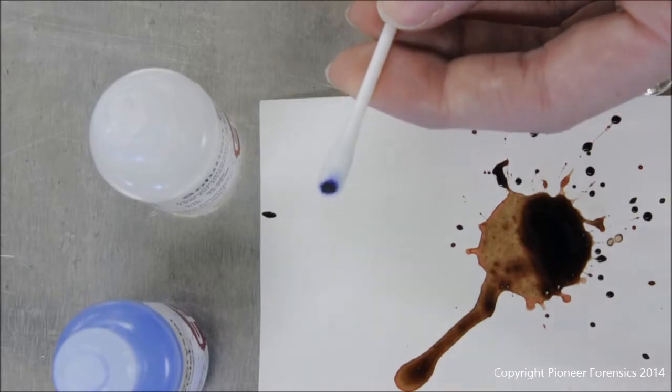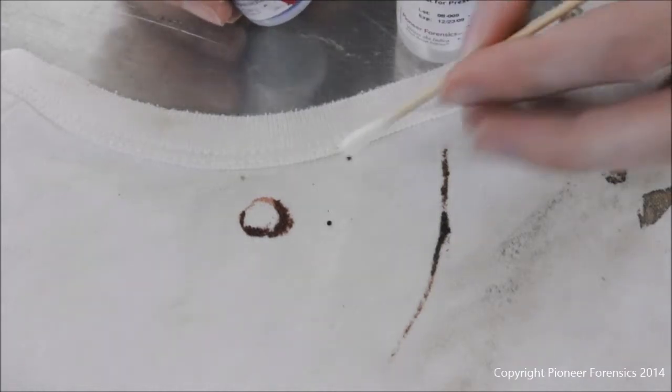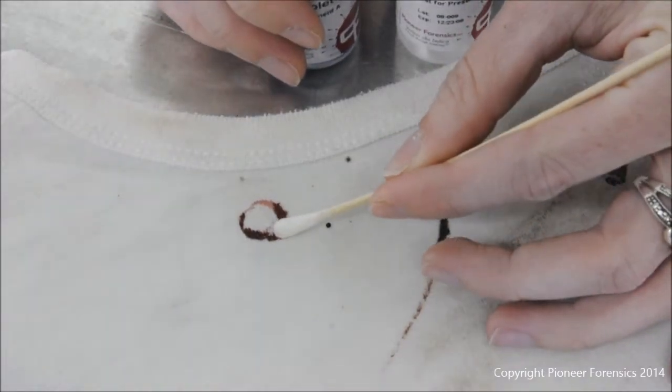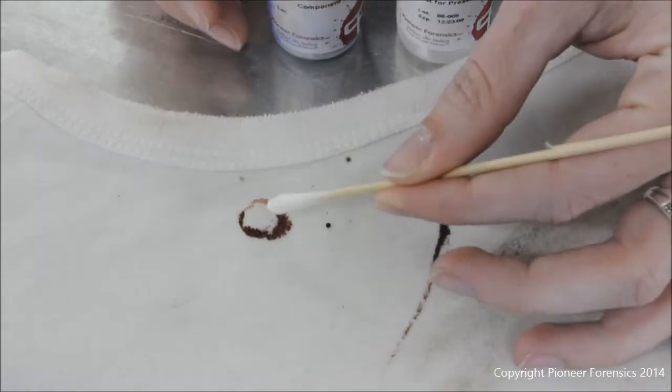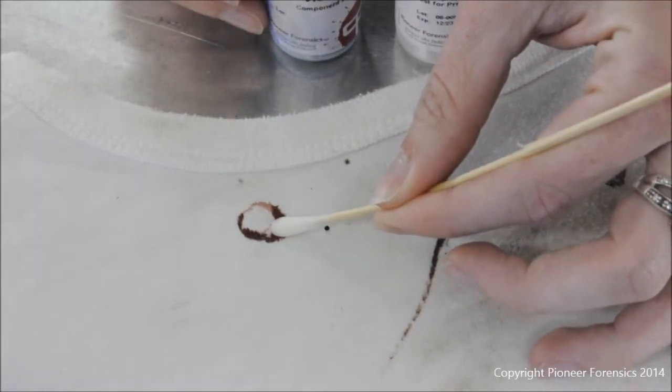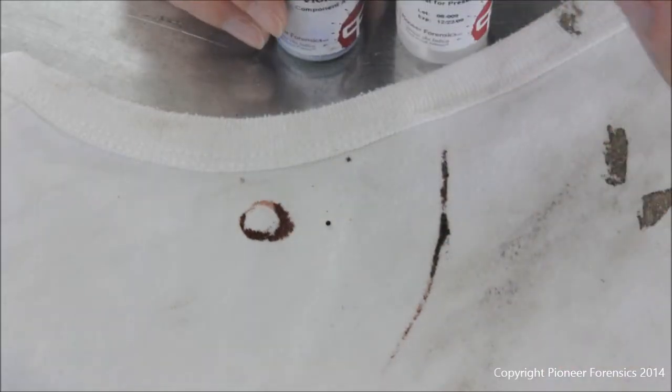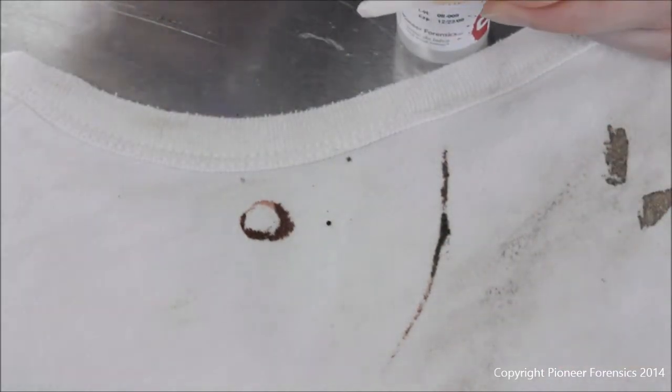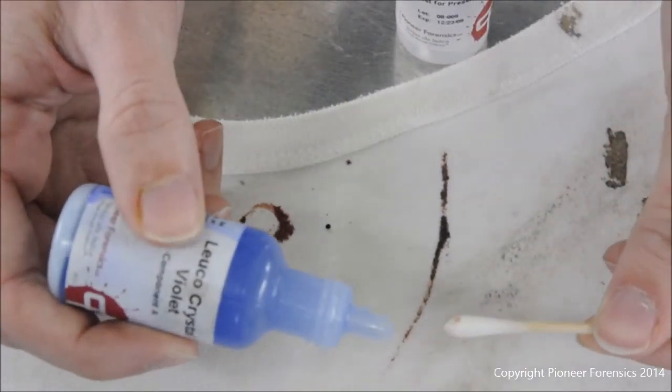This is usually very helpful when you have stains of similar appearance. Blood can take on many different colors and appearances depending on the surface, the length of time it's been on that surface, other substances that may be interacting with it—be it other fluids that are present or other substances that were already on it.